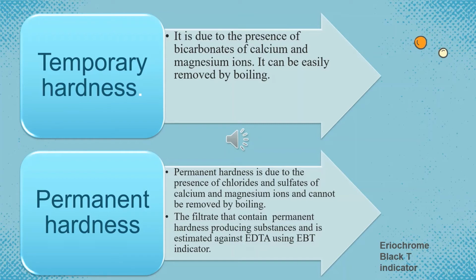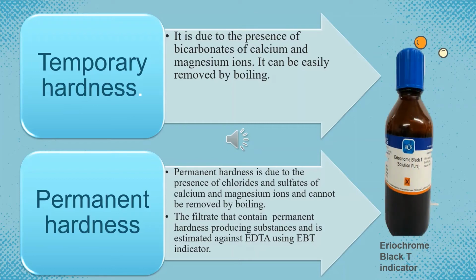Water hardness is usually determined by EDTA, that is a complexing or chelating agent which is used to capture the metal ions. This causes the water to become softened, but the metal ions are not removed from the water. EDTA simply binds the metal ions to it very tightly.